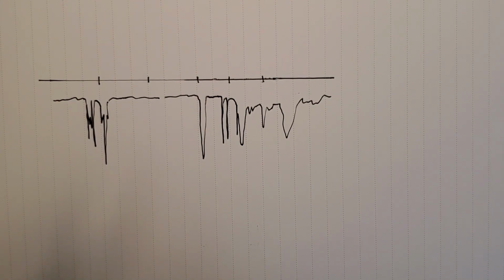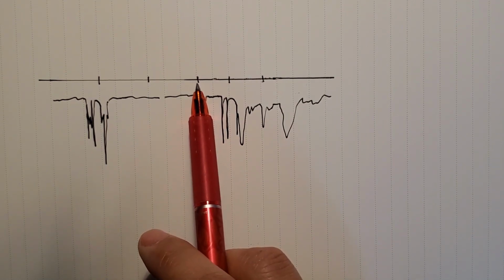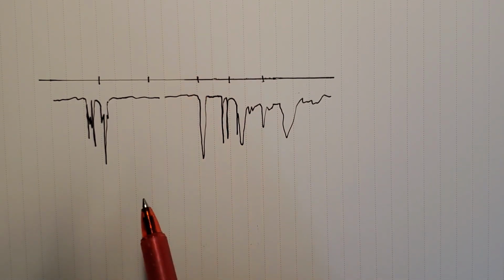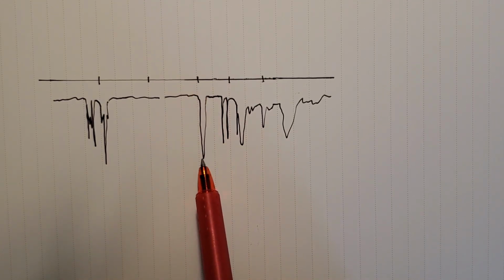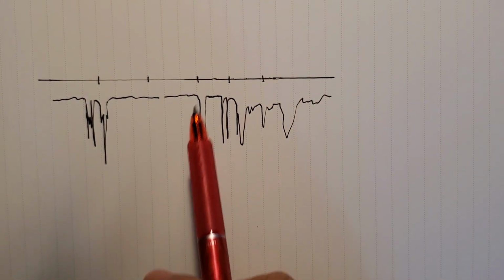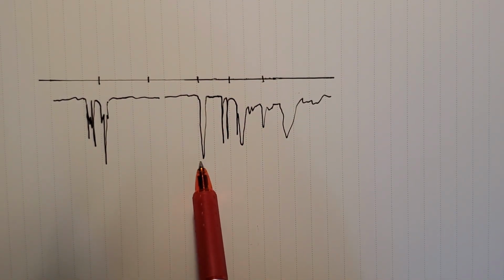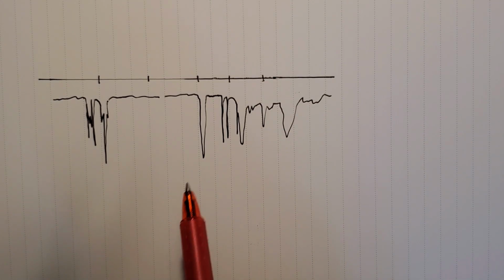And then you notice the CO double bond, the 1700 area, a little less, or it could be on top of it, or it could be slightly bigger than 1700. Either case, you see that as a CO double bond, but it's weakened. So again, the theory of resonance present in the molecule explains this.